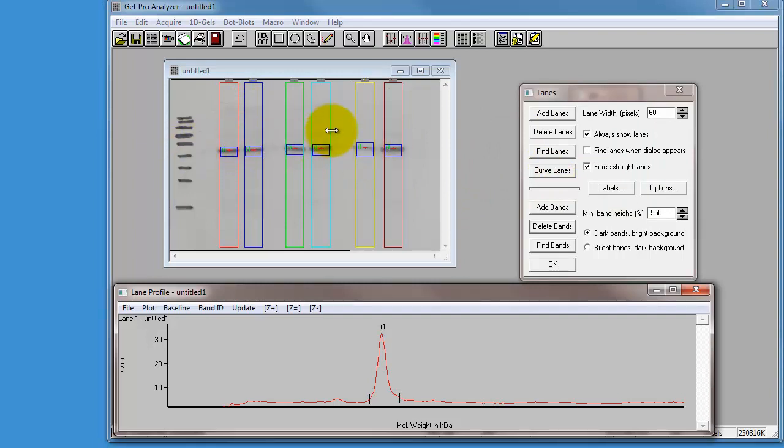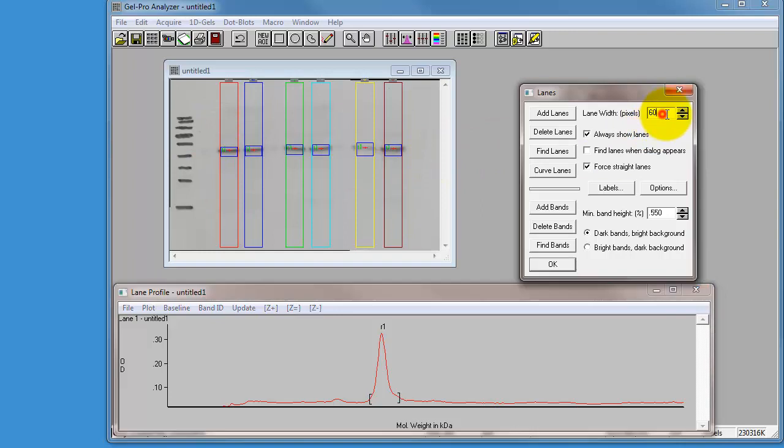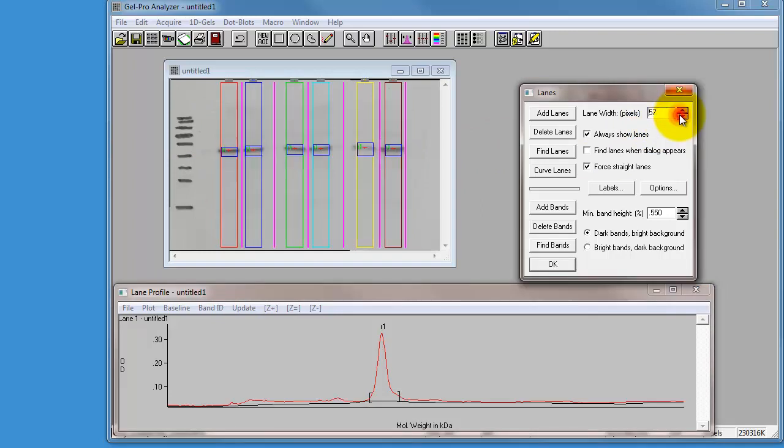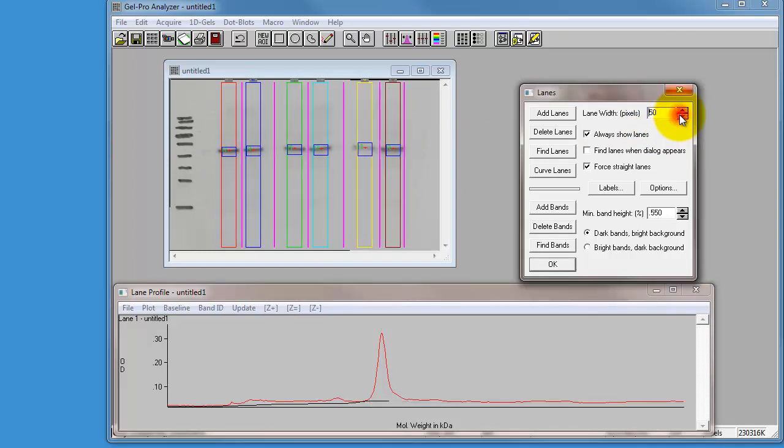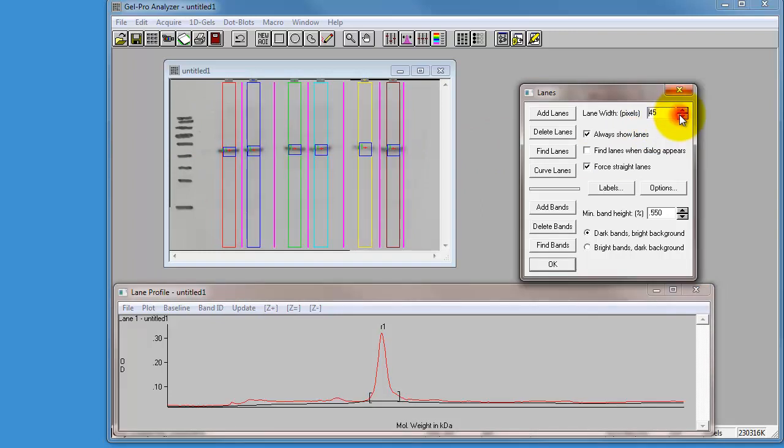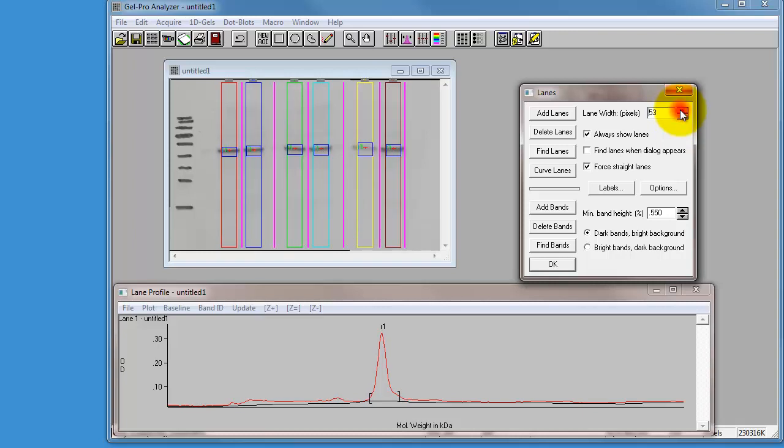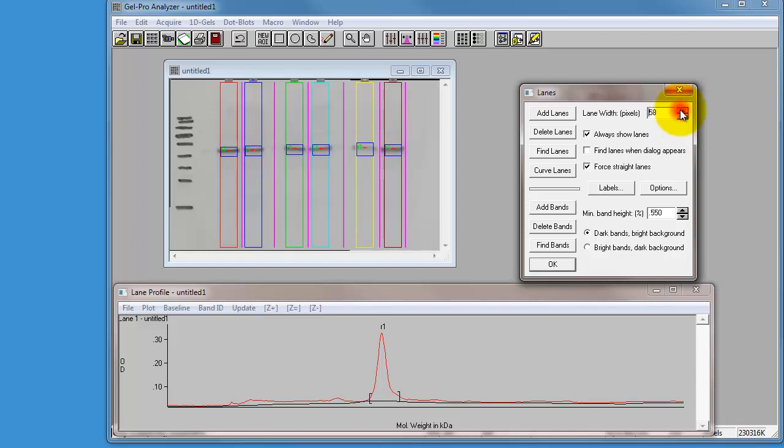You'll notice that the lane width was set at what it says here, at 60 pixels. That just happens to be the right width for this western. You may find that some of your westerns need narrower. I can click this down to make a narrower lane, or click it up to make a slightly wider lane. I'm going to leave that at 60.